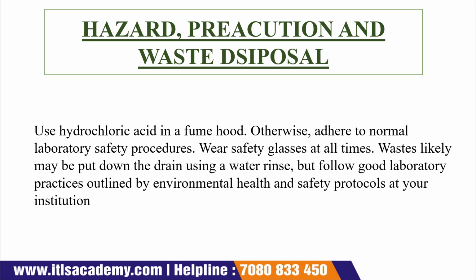The waste generated while performing this experiment should be rinsed with the help of water, and while draining this waste, we have to follow the common practices outlined by our environmental health and safety protocol, which are given by our institution. Okay, now see what is written on the slide. Use hydrochloric acid in a fume hood, otherwise adhere to our normal laboratory safety procedure.